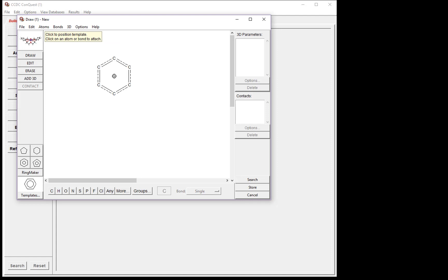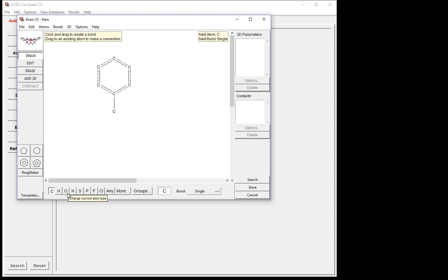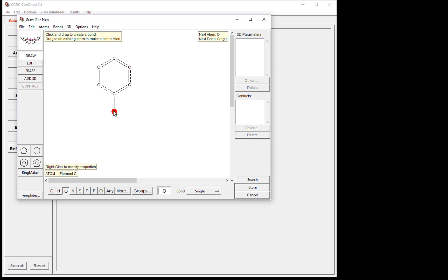Now we want to draw a carboxylic acid group. Click the carbon atom in the atom types list across the bottom of the window. Then click the carbon atom in the phenyl ring, and drag down. Now we have placed a carbon atom. Now we need to add the oxygen atoms of the carboxylic acid group. To do this, change the atom type to oxygen by clicking in the list. Then click the carbon atom and drag to create two oxygen atoms.